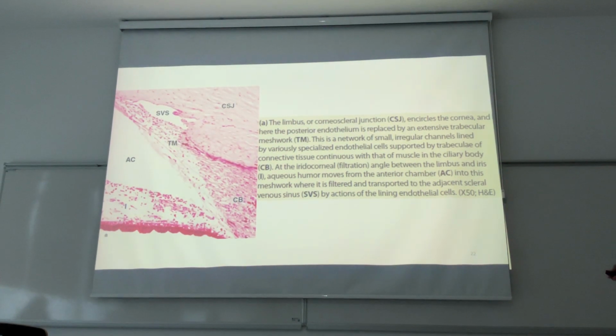Again, in high magnification, you can see the same structure. This is our Schlemm channel. And in the limbus corneal side, we have a meshwork known as the Fontana meshwork, or trabecular meshwork. Here you can see it connected with the Schlemm channel. This meshwork is our trabecular meshwork or Fontana meshwork. And here you can see our iris. This is the angle. This angle is very important.